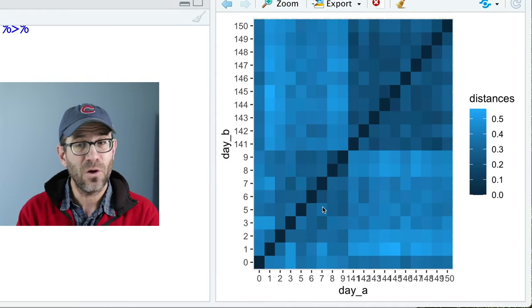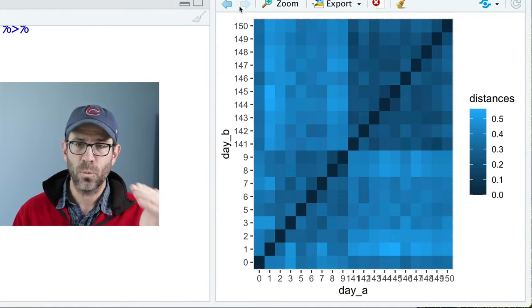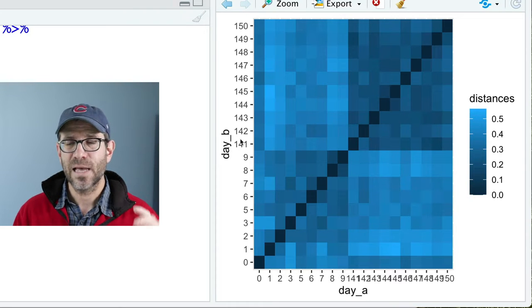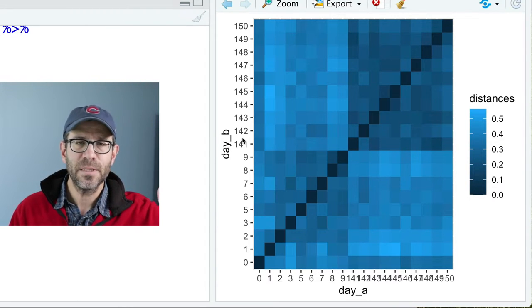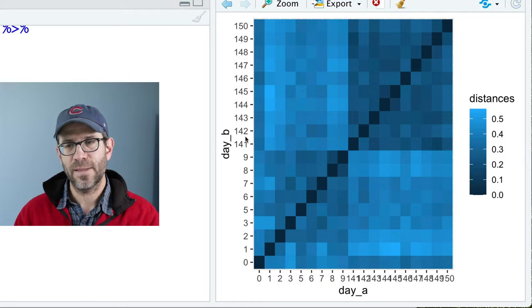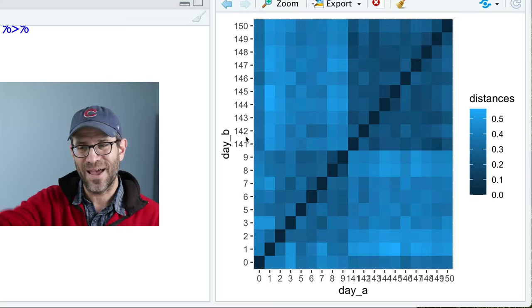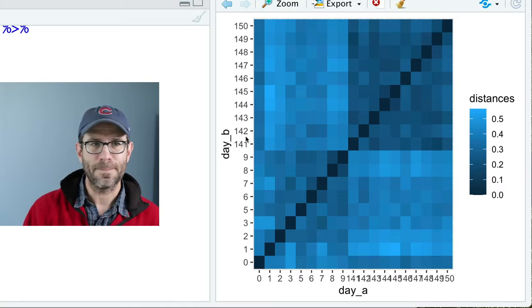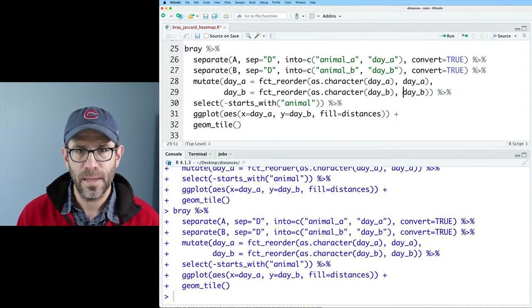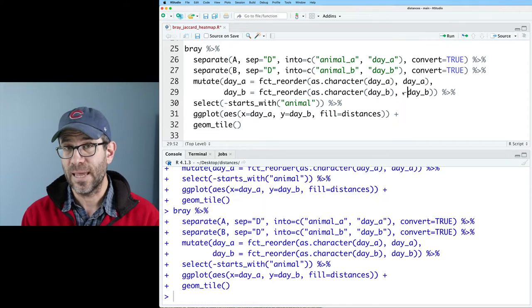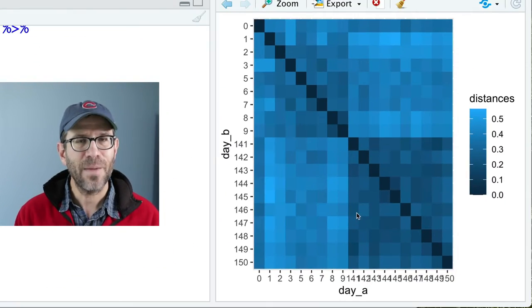Now we have all the data together going from day 0 to 150 on both axes. I'd actually rather have the y-axis flipped so the diagonal goes from top-left to bottom-right. To do that, I can use negative day_B in the fct_reorder to flip the order. This is the heat map for Bray-Curtis. Before I clean it up further, I want to build a similar heat map for Jaccard.